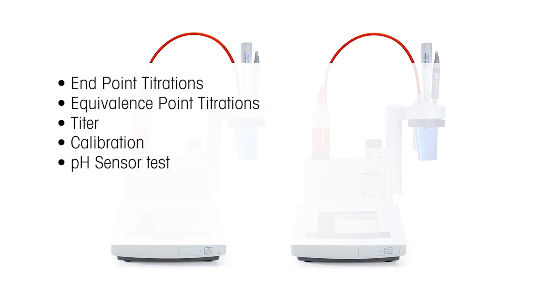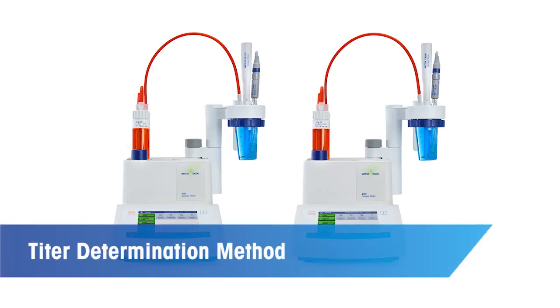The pH sensor test method is used to check the slope, 0 point, and drift of a pH sensor, like an electrode health check. Measure methods are used for controlled transfer of a sensor measuring value, such as a series of pH measurements. Blank methods are used to account for a solvent blank in our titration. Running this method stores the result as a blank value. This stored value is in turn used in calculation of the sample's titration method, subtracting it from the result. Lastly, the learn titration is used, for example, with an unknown new sample to determine the best parameters for carrying out an EQP titration.